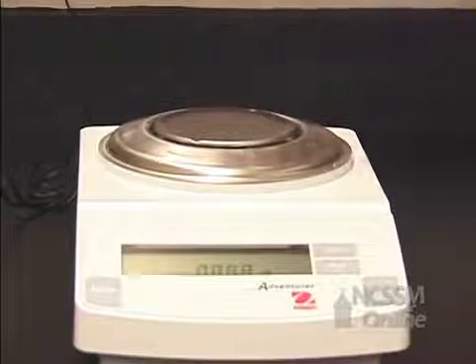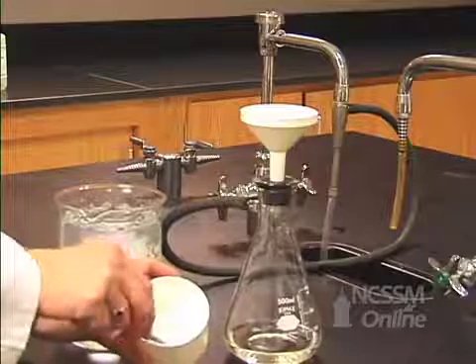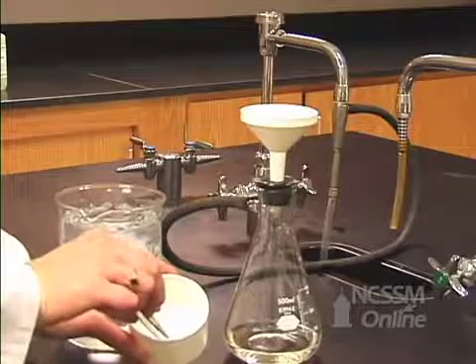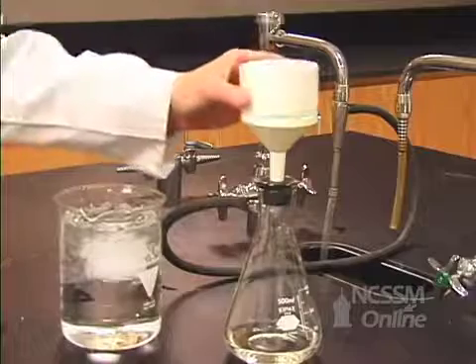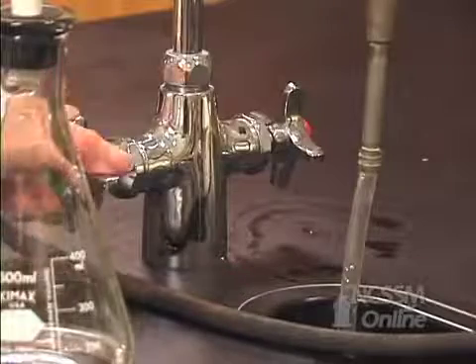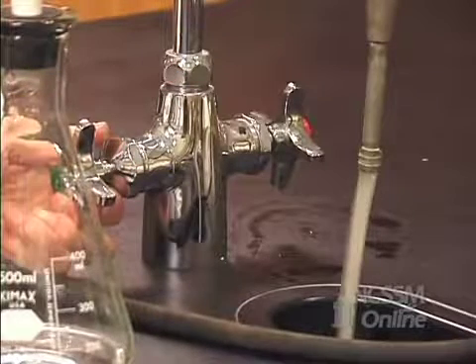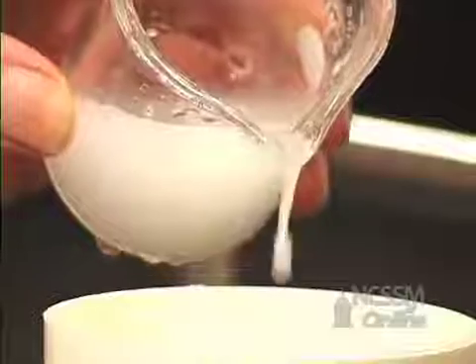I'll place my weighed filter paper in the funnel and set up my filtering apparatus again. Now we can turn on our aspirator and filter.